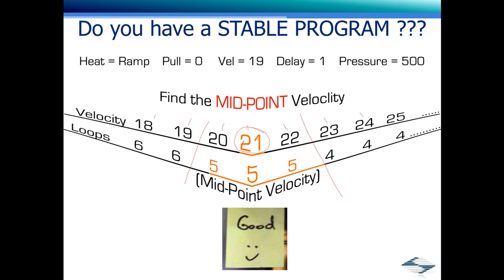and that's your foundation of your program. So then if you write it out into 5 lines, you start adjusting the parameter settings on the last line only. Hopefully you won't run into any problems.